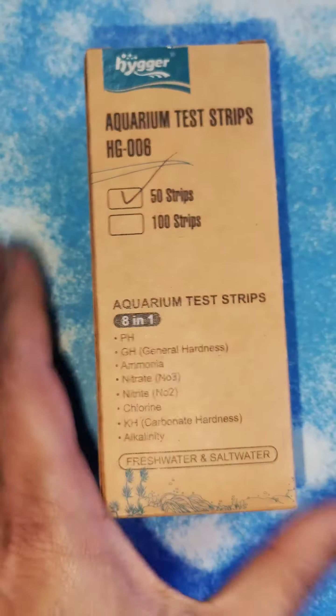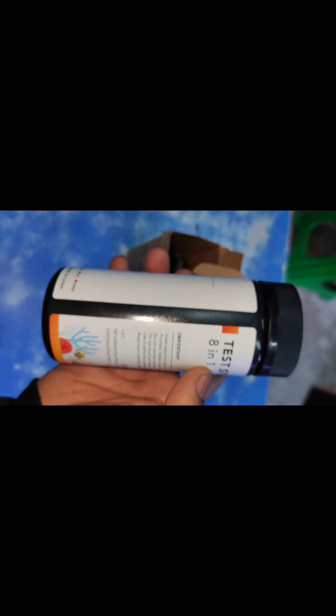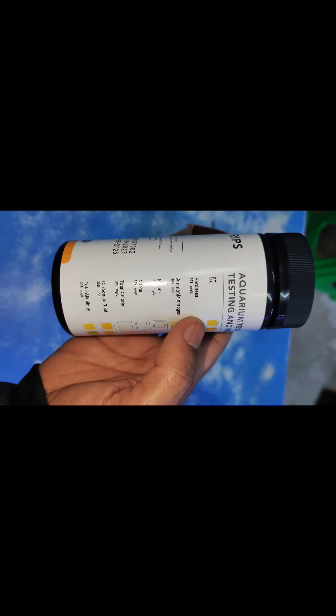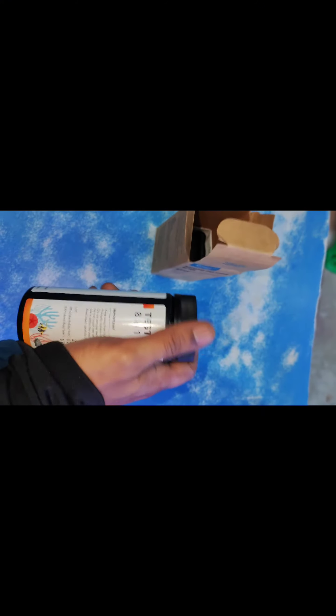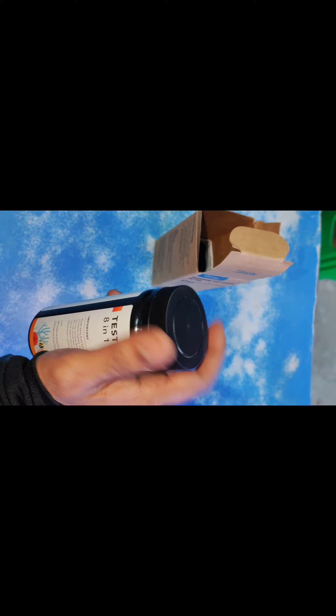Hello everyone. What we're looking at is Haiger Aquarium test strips. We've got this in a packet of 50 strips. We've got this in our store and this is for getting the water parameters up to notch by examining water with this simple strip that allows you to do eight types of different tests. It also has this colorful chart which we can compare when the strip is soaked in water to get the actual result, so that we can keep our tanks and ponds in a healthy manner.